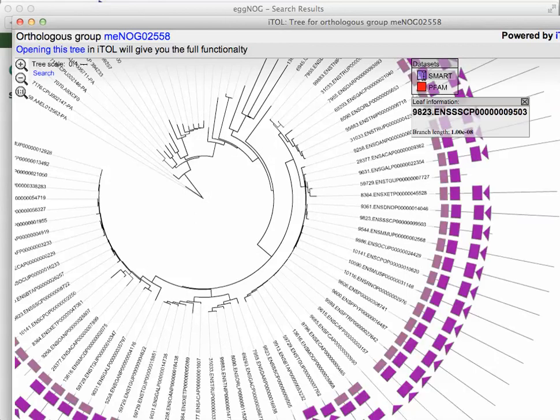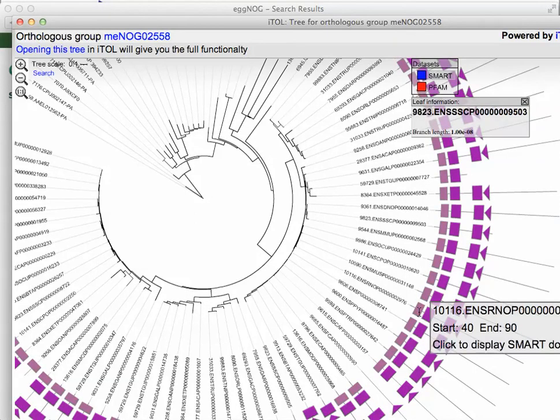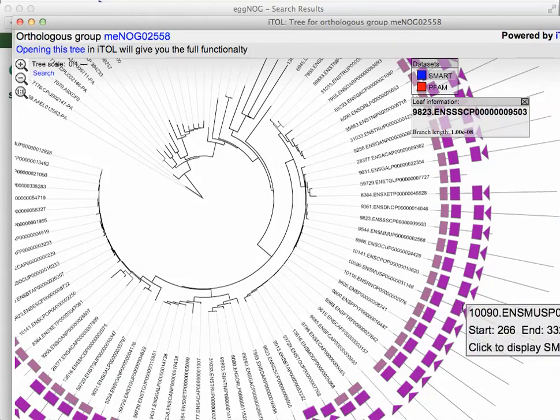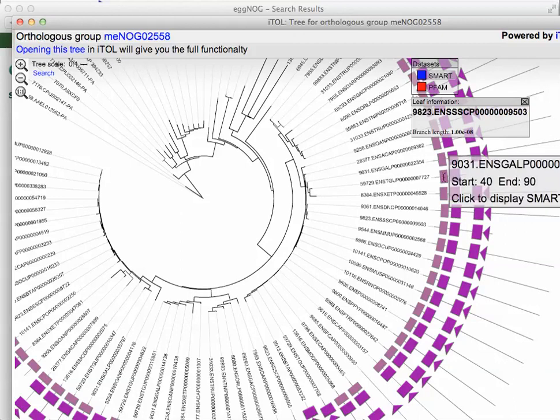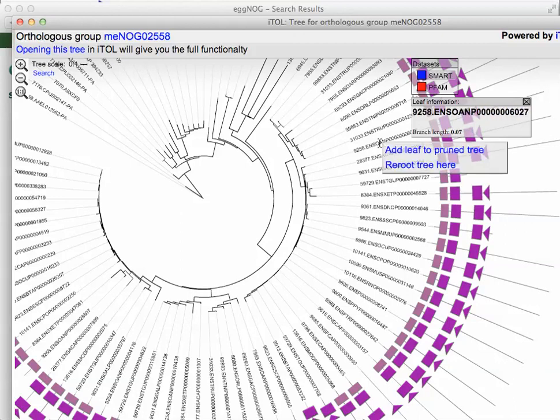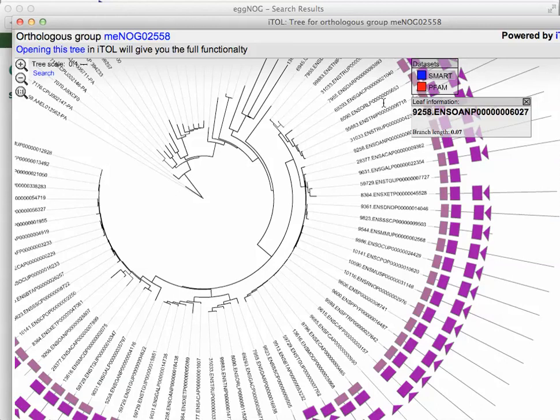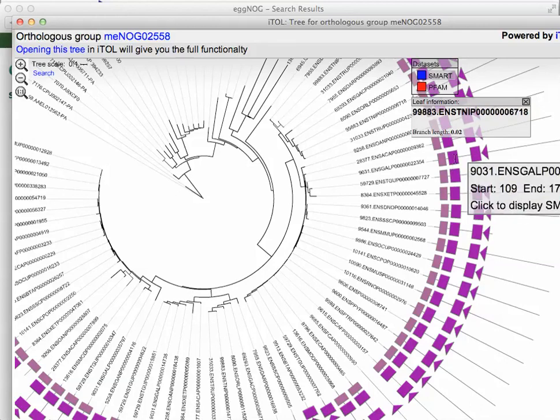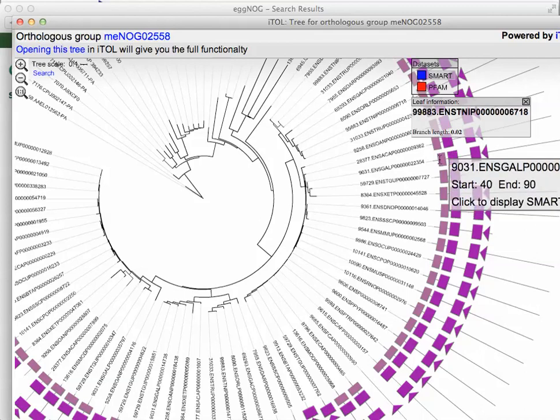You can look at the SMART domains. So, for example, here are the domains in the clock genes in these different species. As you see, they're listed by ID here. I can scroll over, and it will give me some information about that protein. If I scroll over the domains, it gives me domain information from SMART.